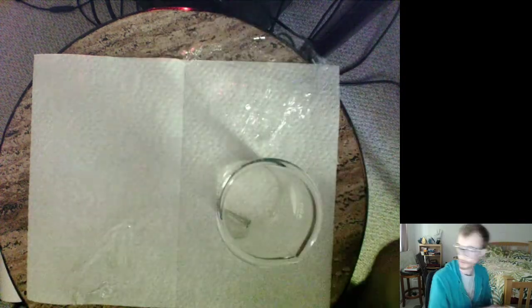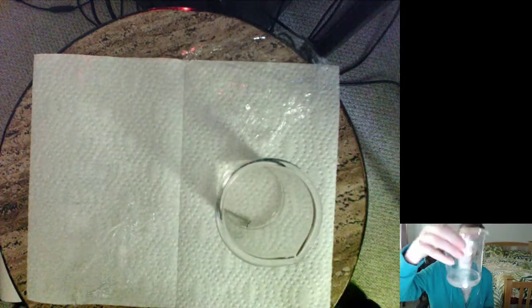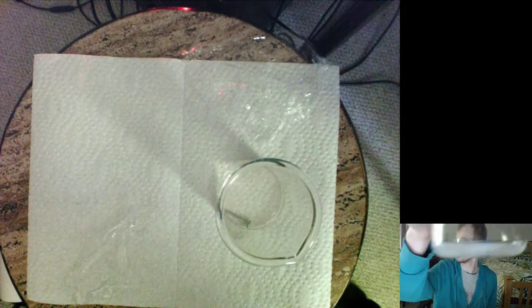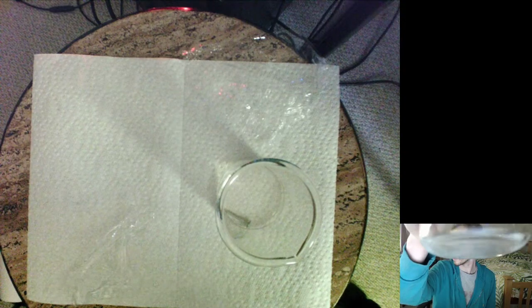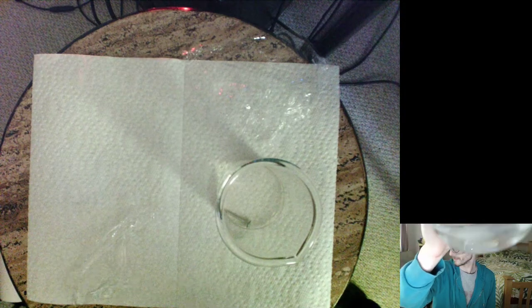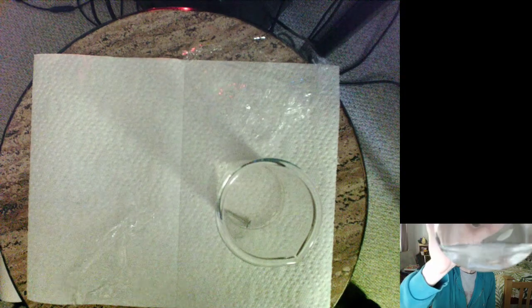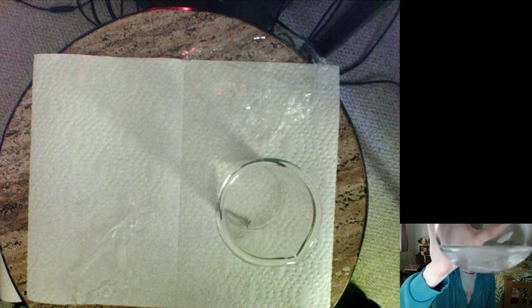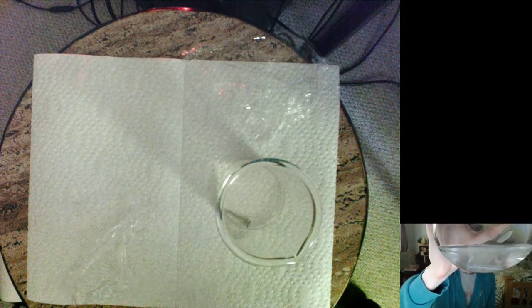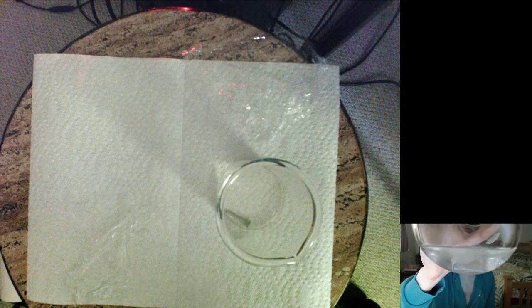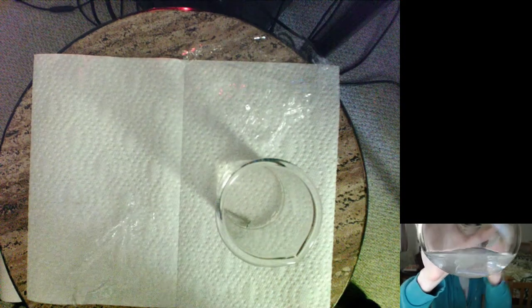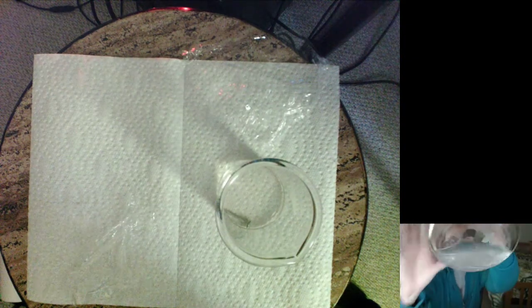Might still be difficult to see. Let me try on this camera. Oh yeah, you can definitely see that. Let me just blow up this screen.